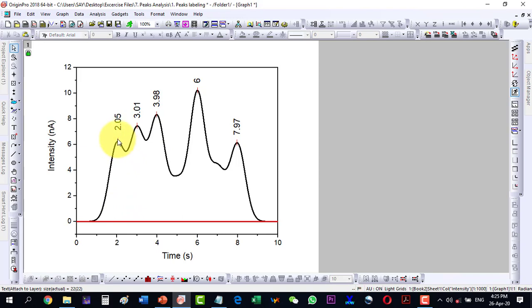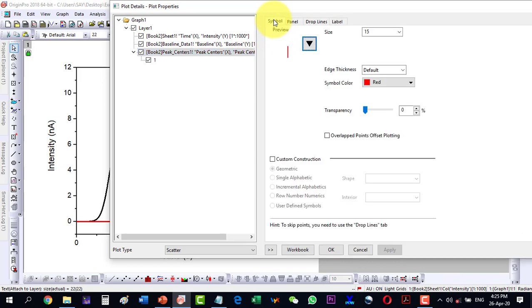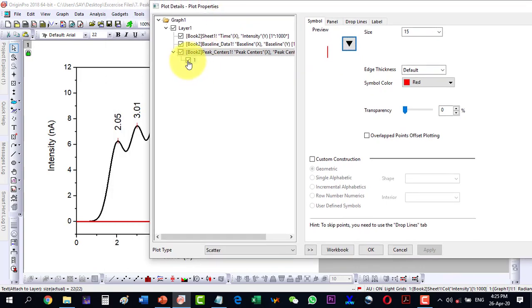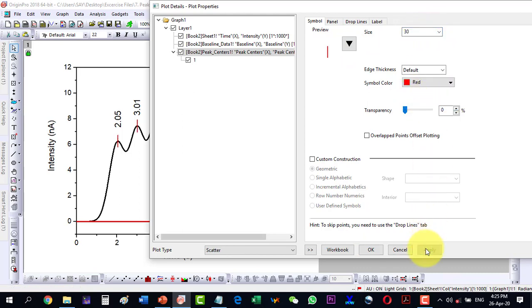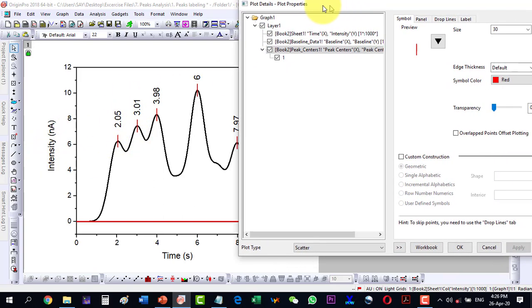If I want to change the label and the line size, select the peaks and then double click — a menu will appear with options to change. If I go to Symbol, I can see the symbol for each peak and its size, which is currently 15. I can change this size to 30, click Apply, and you see that it has changed all of them to size 30.